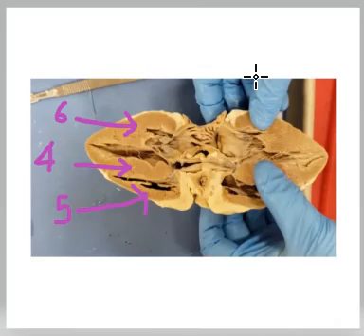Thank you for coming back and participating in the Sheep Heart Mock Practical. This is a Sheep Heart dissection. There is a feature of the Sheep Heart that divides the ventricles.